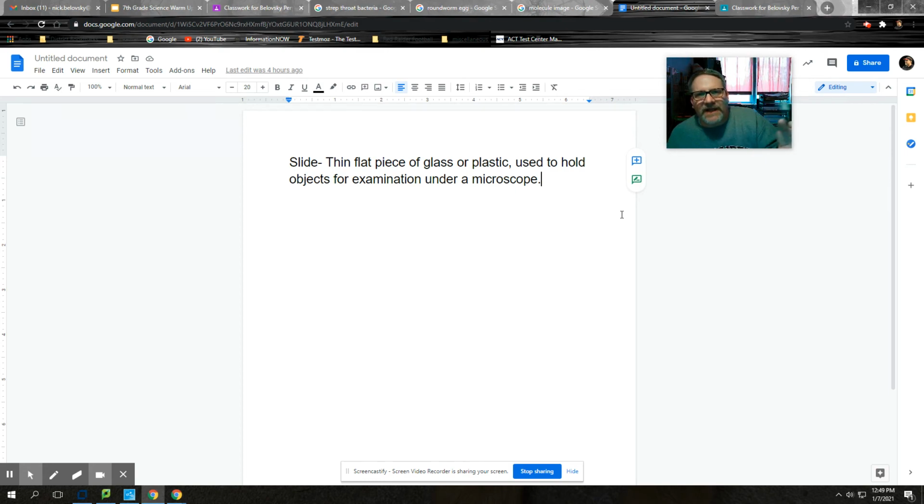But the majority of the ones that I use in class, that I allow students to use, are plastic. These right here can break easily and they can hurt you. That's why I like to use plastic slides in class. It's a little bit safer. All right. Okay, so that's all the definitions that there are.